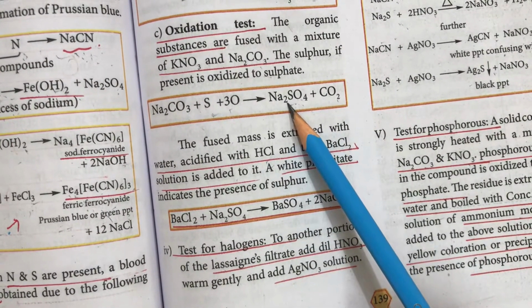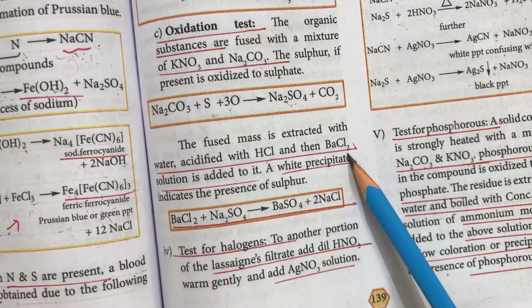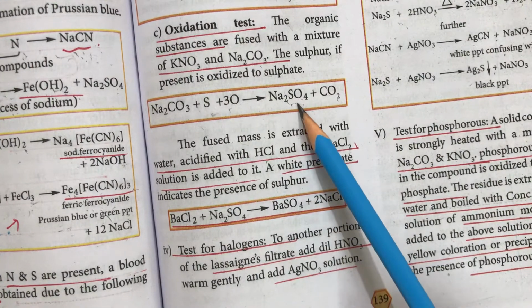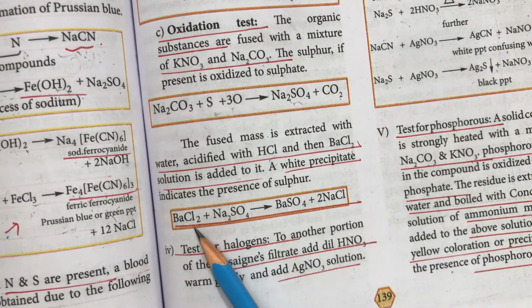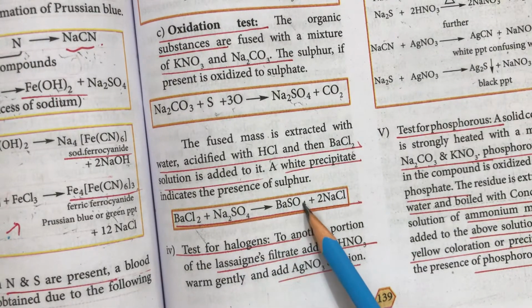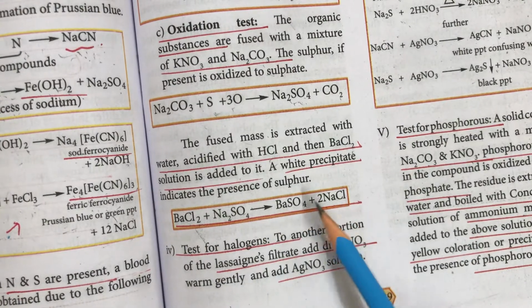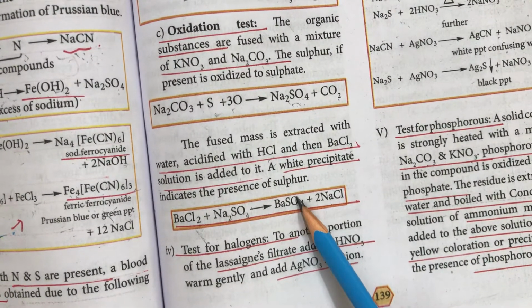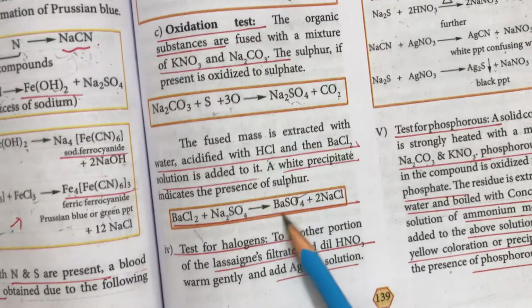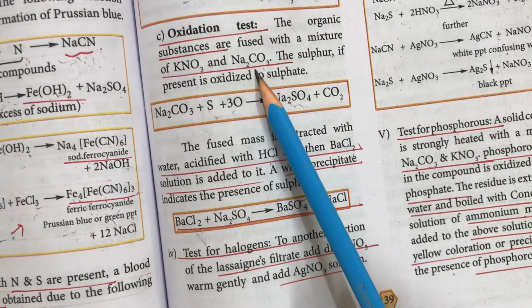It is extracted with water, acidified with hydrochloric acid, and treated with barium chloride solution. The sulfur in the form of sulphate salt easily reacts with the barium chloride. So, barium plus sulphate forms a double decomposition reaction, giving sodium chloride and barium sulphate. It forms the white precipitate of barium sulphate, which is insoluble in concentrated HCl. The formation of a white precipitate of barium sulphate shows the presence of sulfur in an organic compound.